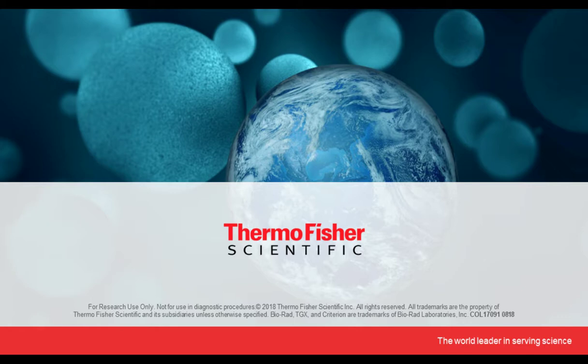One of the reasons can be while preparing fresh 1x sample buffer, if for some reason it's less than 1x. So for example, if you add a little less buffer so that it's really not 1x, that can result in a dilute sample buffer during electrophoresis, which can cause the wave.